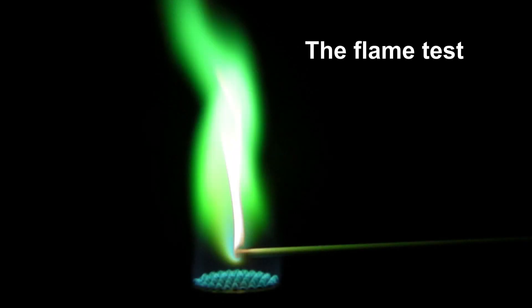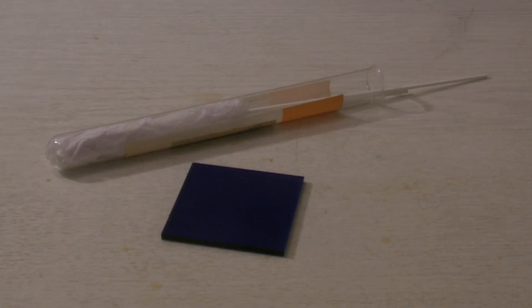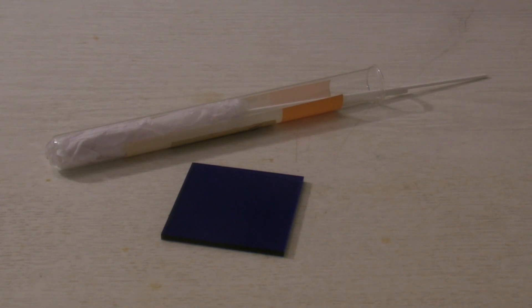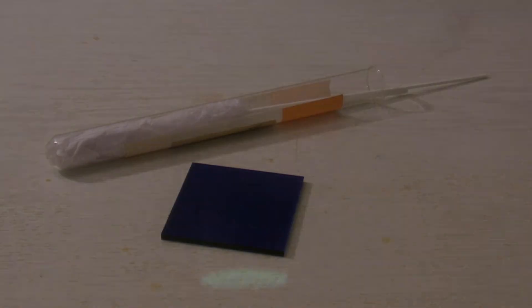The flame test. For the flame test, a cobalt blue glass and magnesia sticks, or even better a platinum wire, is used because the latter doesn't have a flame color.